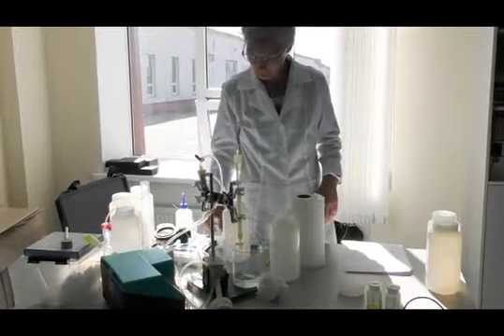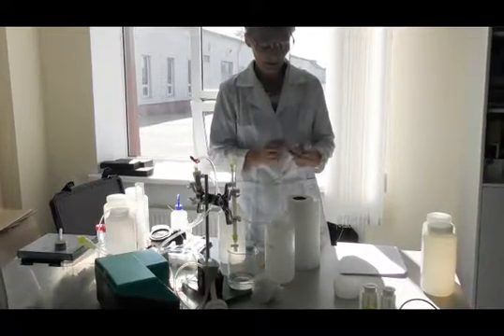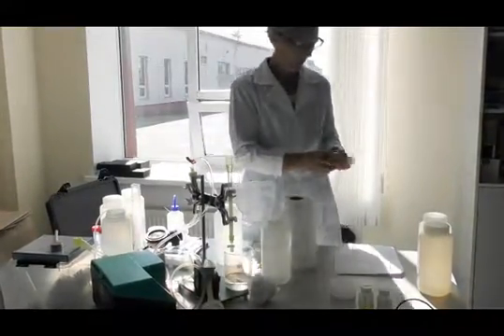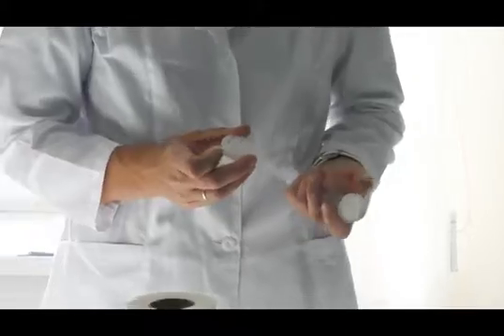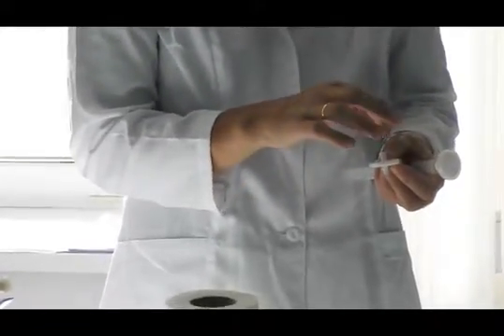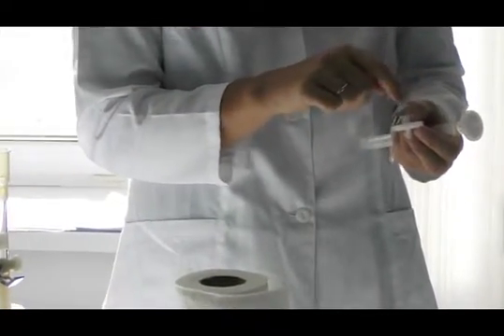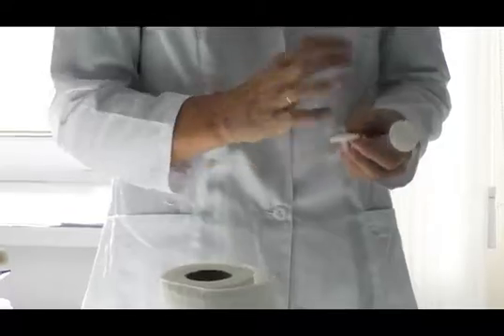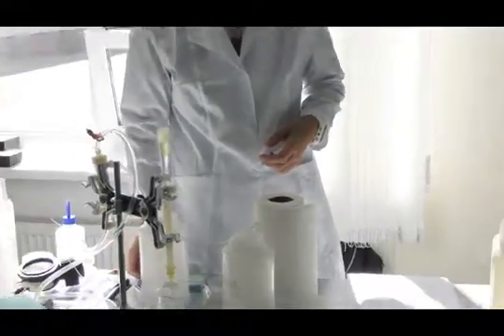There are a lot of different filters that can be used. You have probably seen this before. They are okay with very small samples, but the surface of this filter is not many square centimeters, and you press the whole sample through the filter. It's very easy to clog or even to destroy the filter, because you use force to press the water through a very small area. For small samples it's okay, but for bigger samples you need bigger filters.